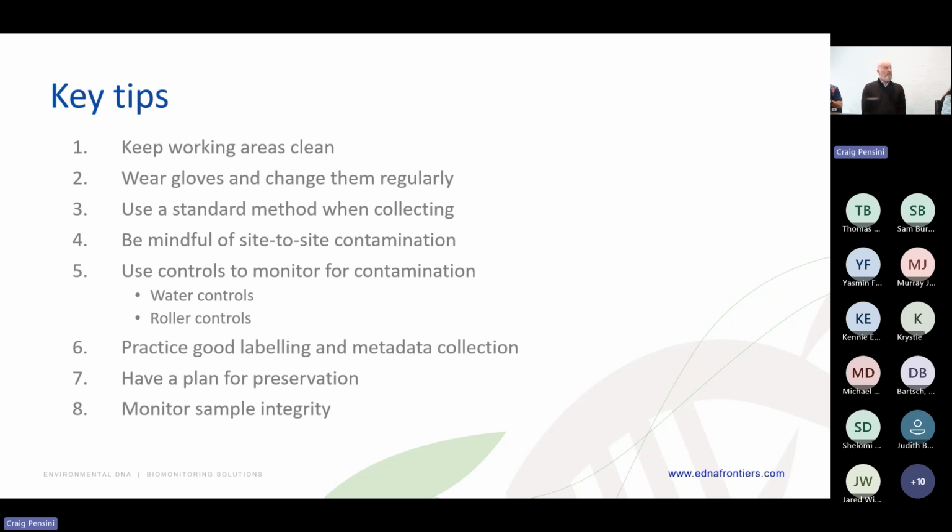process. Try to use a standard method when you're collecting, so come up with your theory of how you're going to open packets and pull out your kits, and when you're going to put on your gloves. Have someone maybe watch you to see if you touch your nose or pull back your hair or something. Also, just be mindful of site-to-site contamination. Anything that you take from one site to the next, just be mindful of what's there, because it might be carrying a signal from that last site that you then might pick up in your new site.